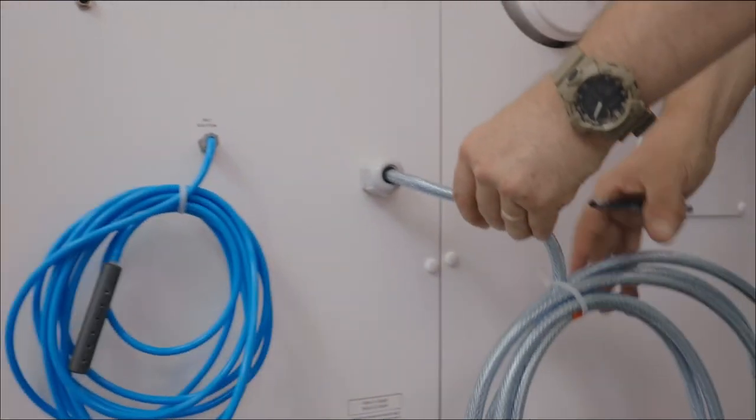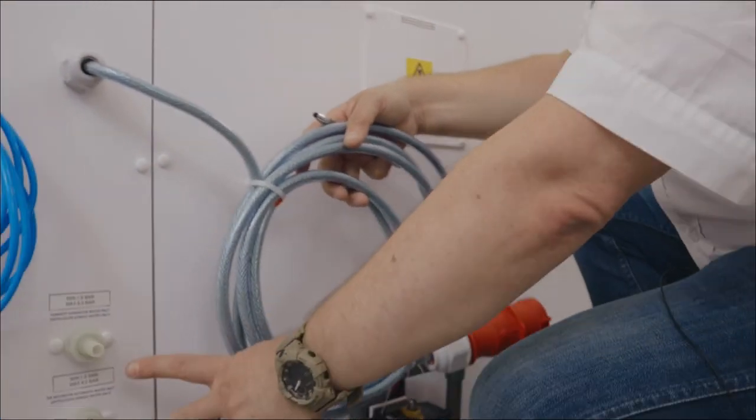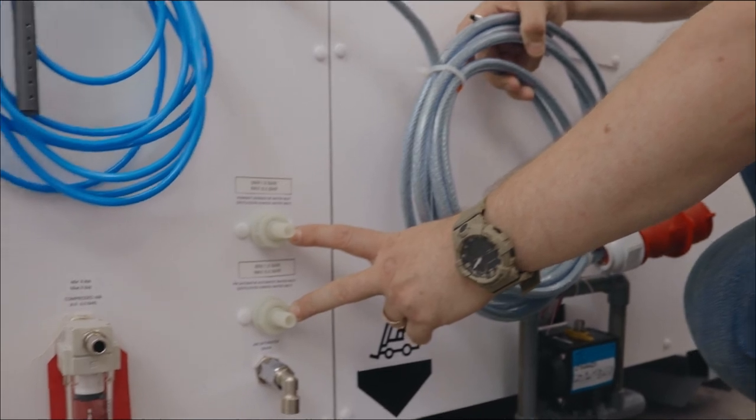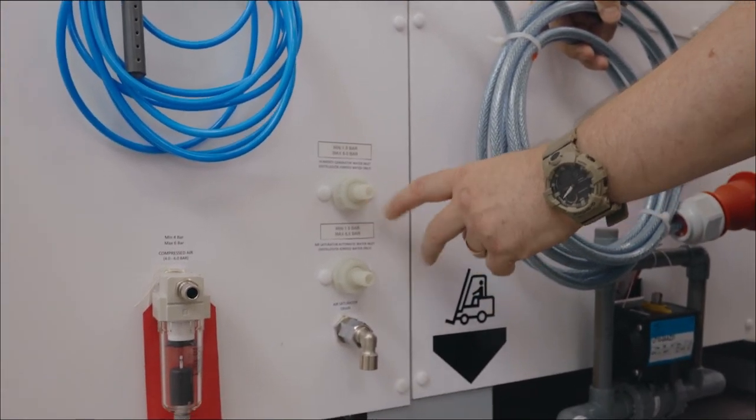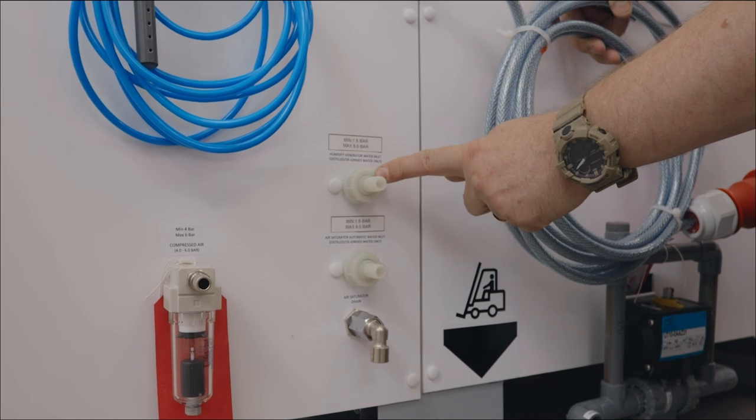We have the mains power cable and below this we have two deionized water inlet connections for the air saturator and humidity generator.